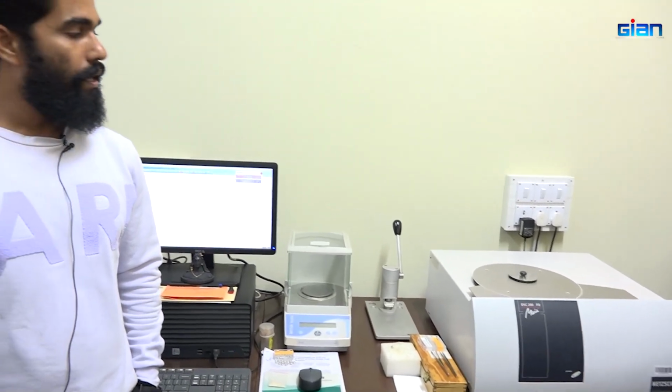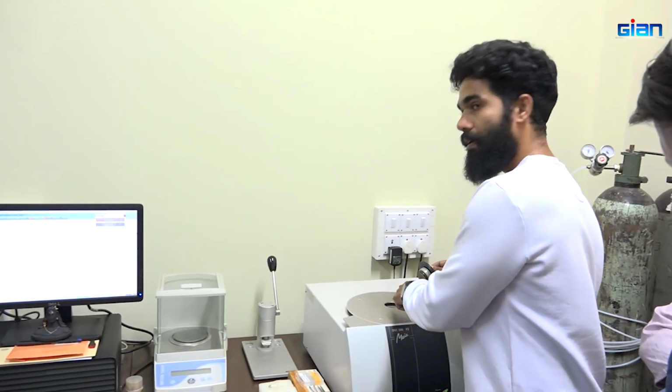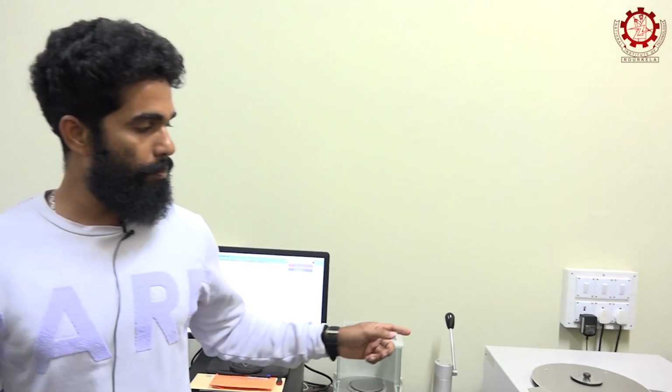Then come to the working principle. This is your furnace. There are two slots. In one pan we are putting the sample only, and the other pan is an empty pan. Both pans are subjected to a controlled temperature range, that means the same controlled temperature. We will set the temperature at a controlled rate.